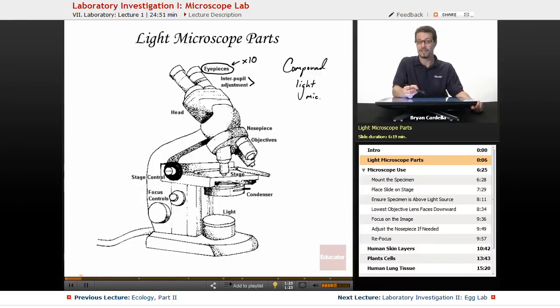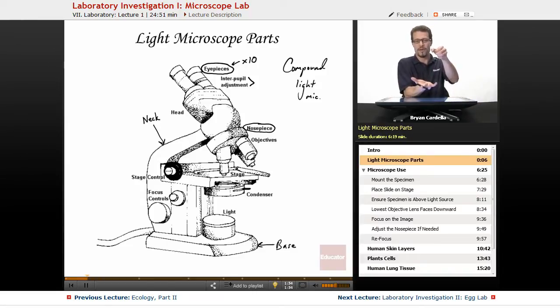It's not just the eyepieces that the image is actually traveling through in terms of the light reflecting off of it. It's actually going through these objective lenses, which I'm going to get to in a sec. The head of the microscope here, the nose piece, an important part in terms of rotating these objective lenses. The way that you actually would tend to hold the microscope if you were picking it up is by the neck and the base. I typically instruct students to grab the neck with one hand and put their hand under the base just to make sure you're not going to drop it.